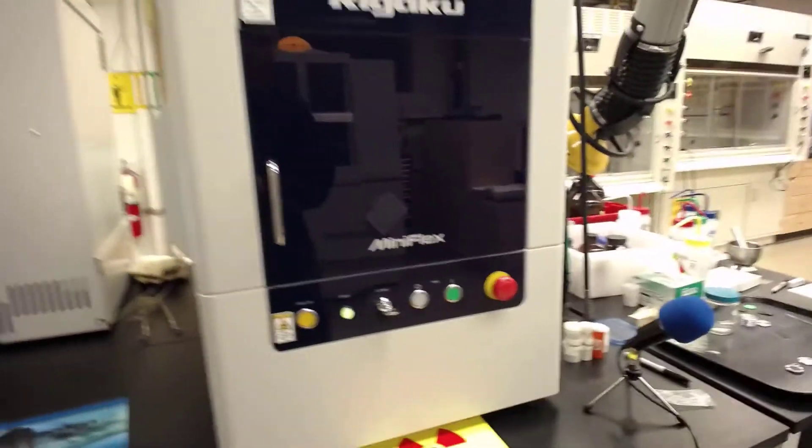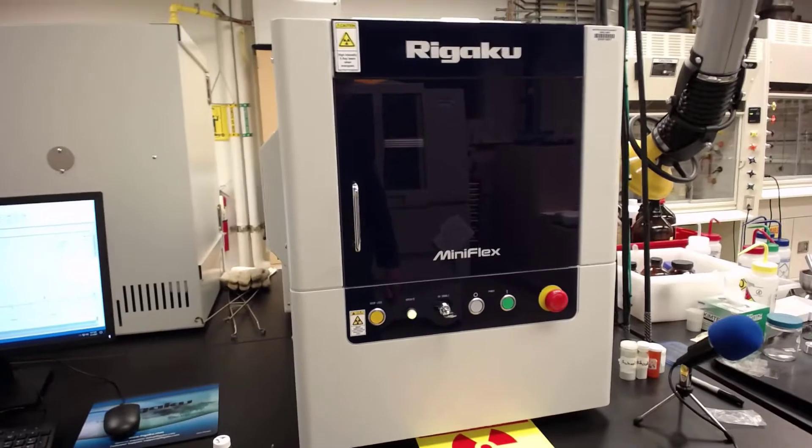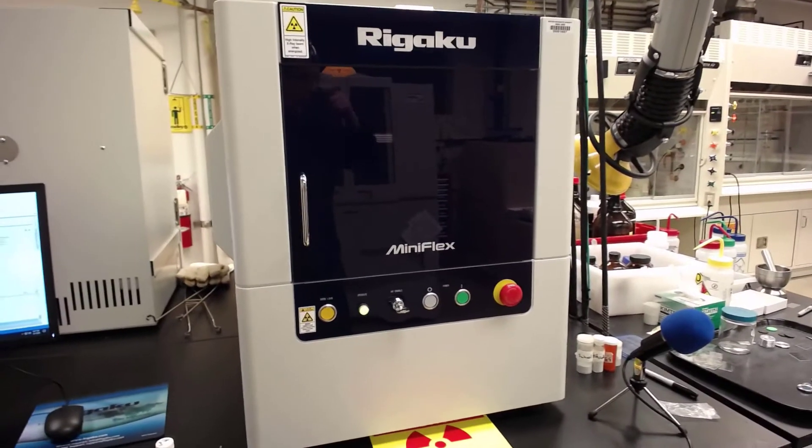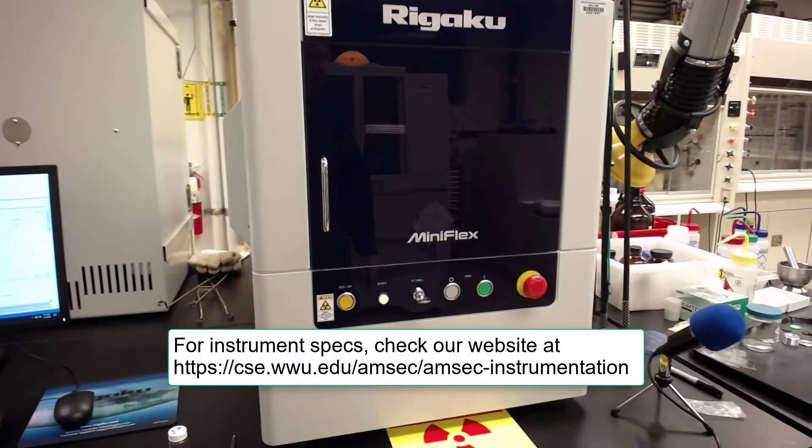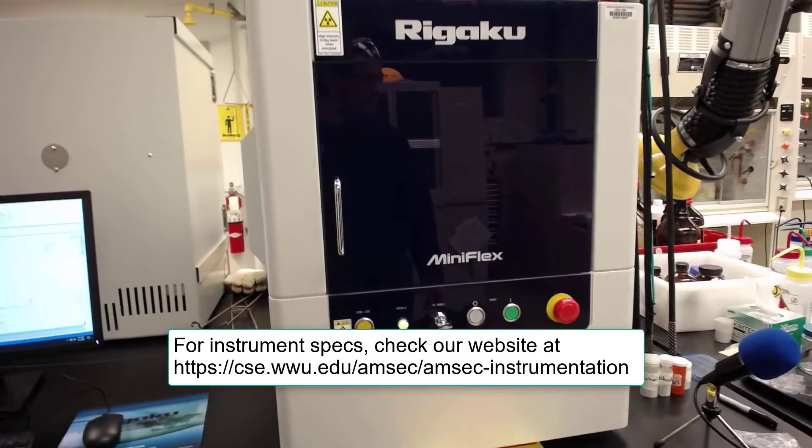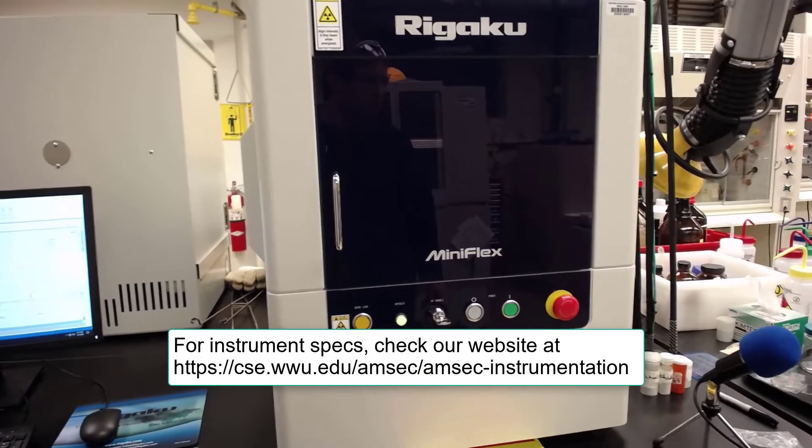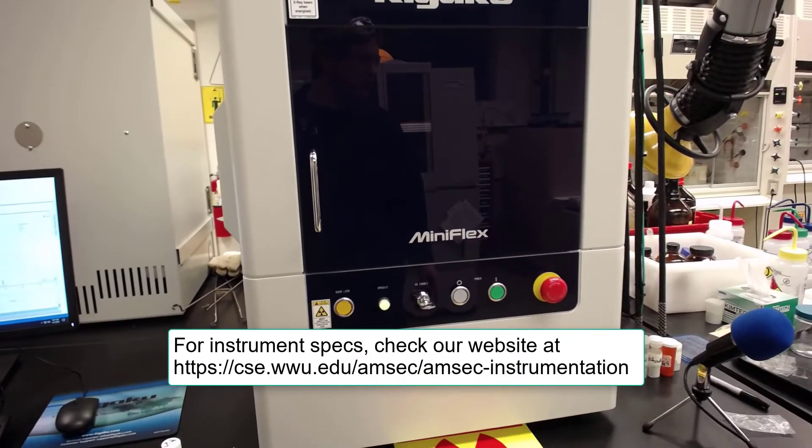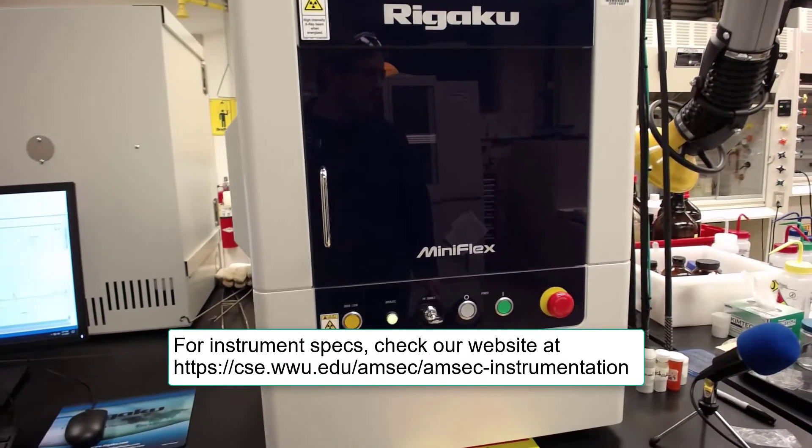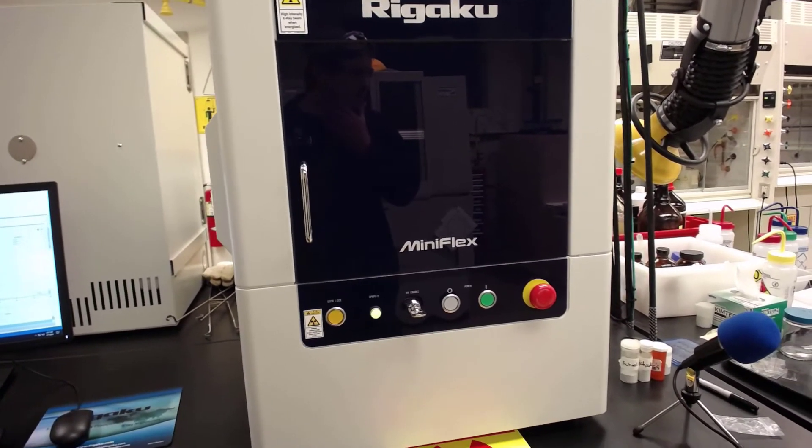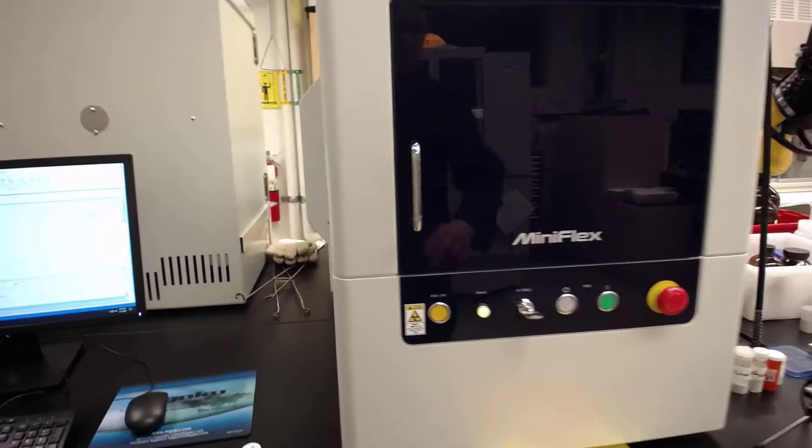The instrument itself. This is one of two XRDs that AMSEC has. This is our high throughput benchtop system. It's a Rigaku MiniFlex 600 G. And it is a high throughput system with an 8-position auto sampler.